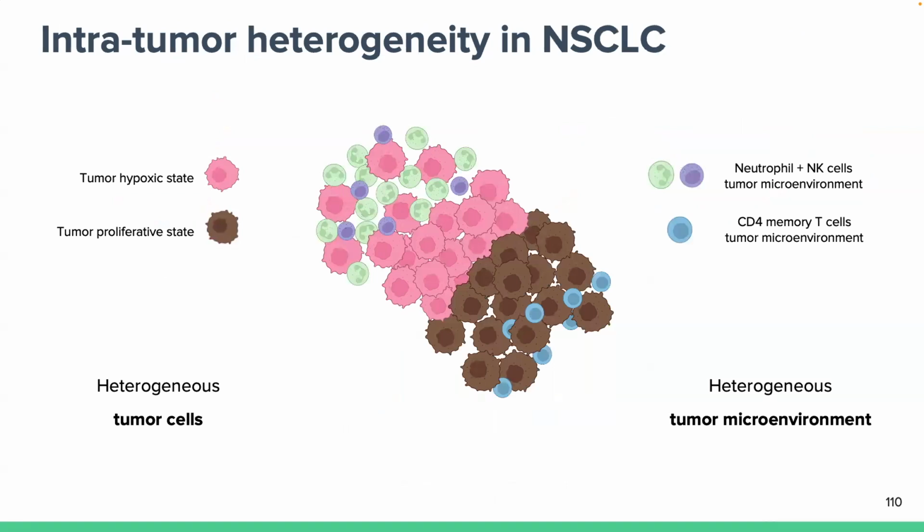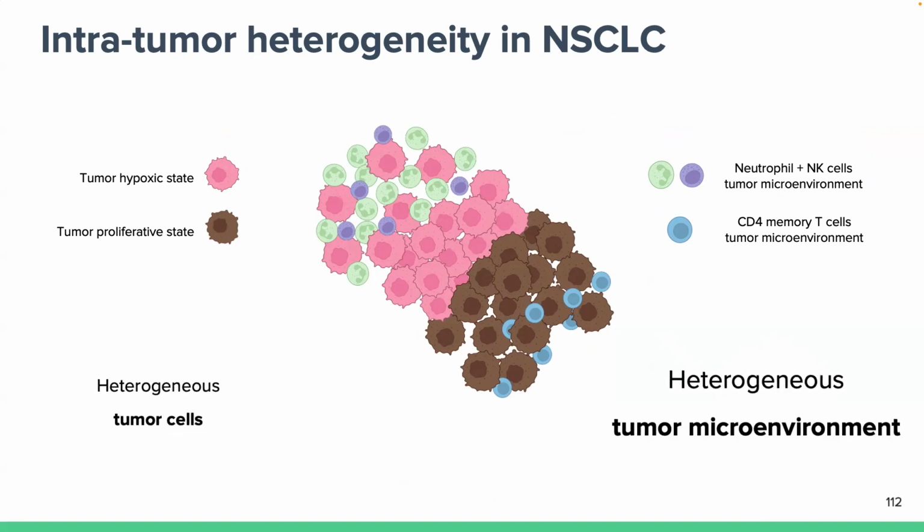And so I wanted to show this analysis because it shows that through the use of spatial domains, we were able to characterize two types of heterogeneity within the same patient. Heterogeneity of the tumor cells, because we saw two different subpopulations characterized by different transcriptional states, but also surrounded by different domains, and so different microenvironments. Of course, we still don't know which causes which: if the changes in the transcription of the tumor cells induce changes in the microenvironment, or vice versa.